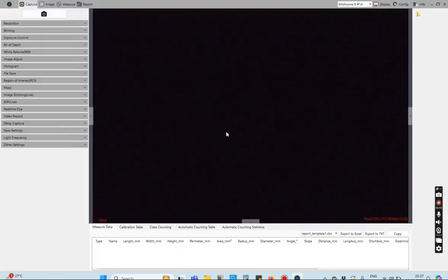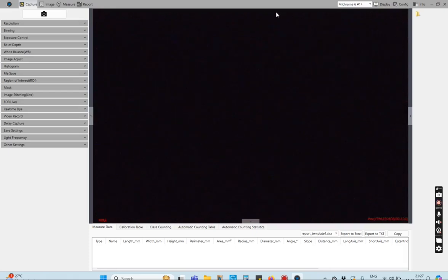Hello, in this video we will see some of the typical features used in the Mosaic software, which comes with a touch-in camera.